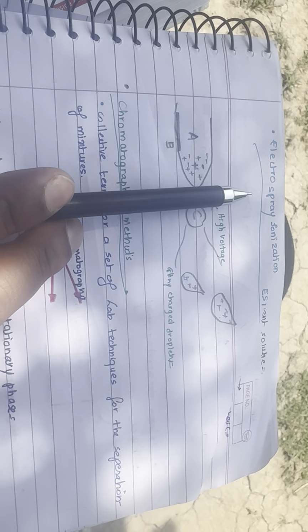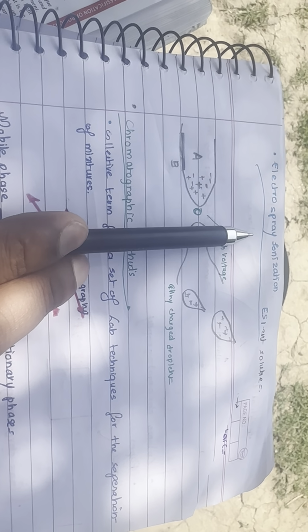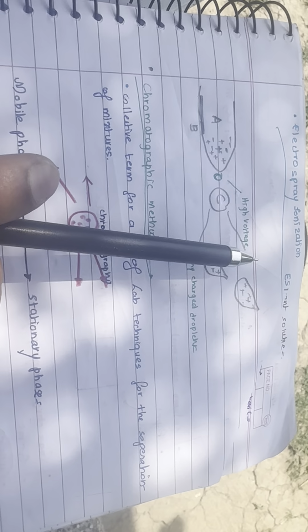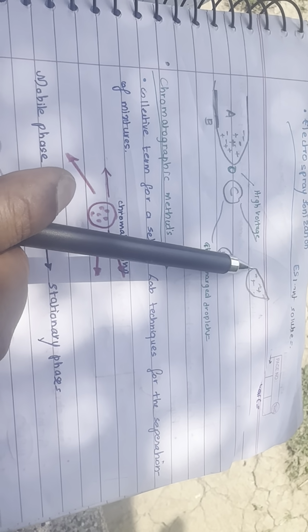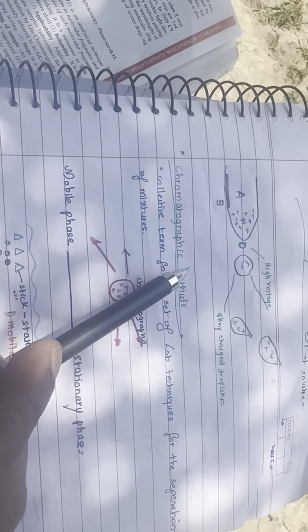Electrospray ionization is another method. Separation: ions are subjected to an electric field, and their movement is according to their mass to charge ratio. Detection: ions are detected and analyzed. This ion signal is processed into a mass spectrum.